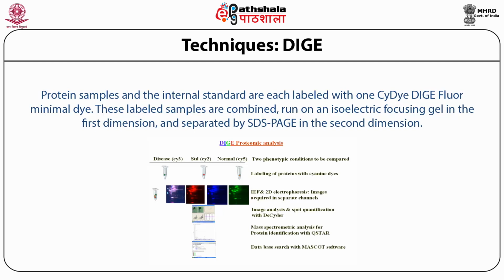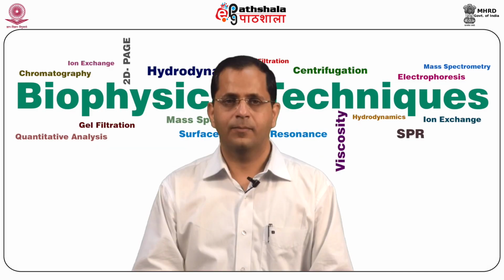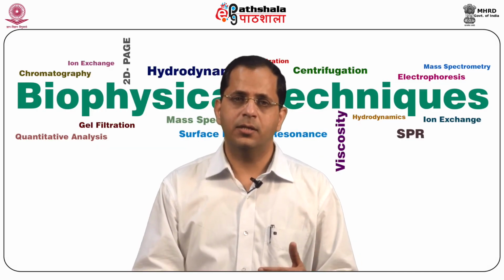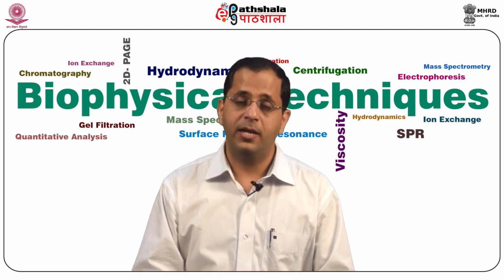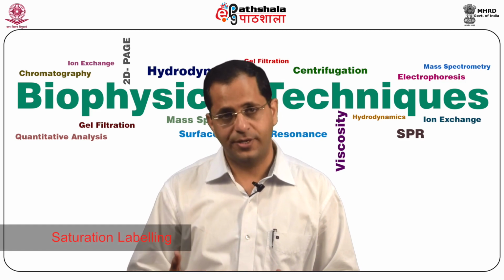The data generated on the mass spec machine is now used to match the theoretical mass to charge data that is available on the net, and the proteins are now identified. We have now understood the application of minimal labeling in DIGE technique. Let's go on to understand saturation labeling.